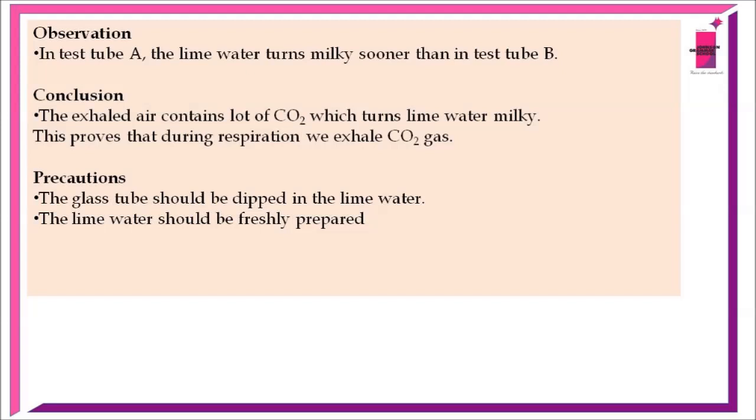Precautions. The glass tube should be dipped into the lime water. The lime water should be freshly prepared.